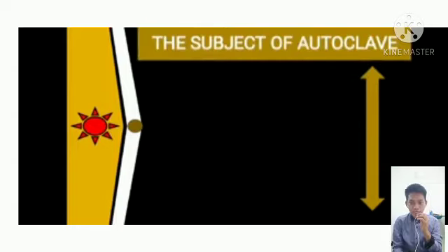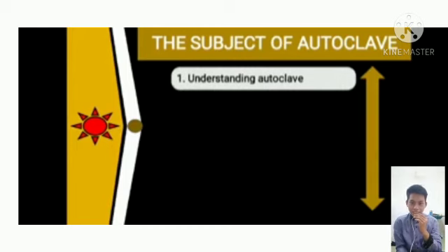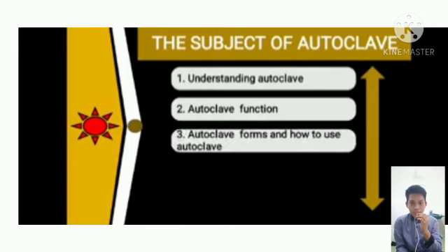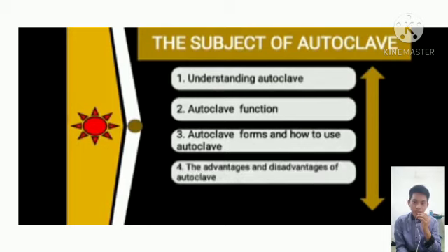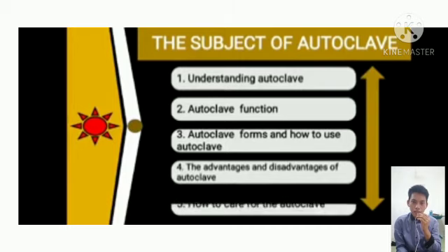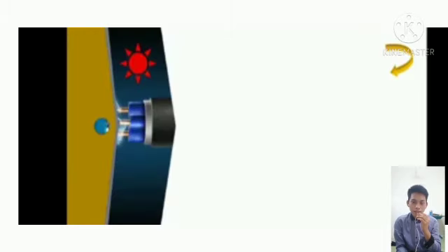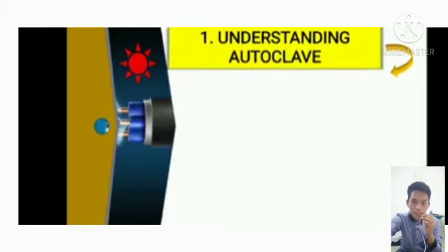Okay, here are the subjects of autoclave. First, understanding autoclave. Second, autoclave function. Third, autoclave form and how to use autoclave. Fourth, the advantage and disadvantage of autoclave. Finally, how to care for the autoclave. Okay, first, understanding autoclave.